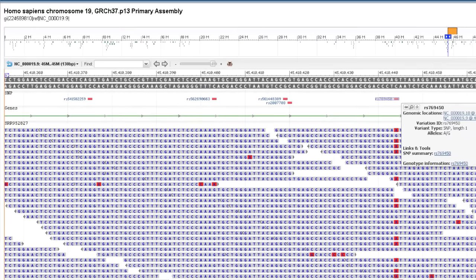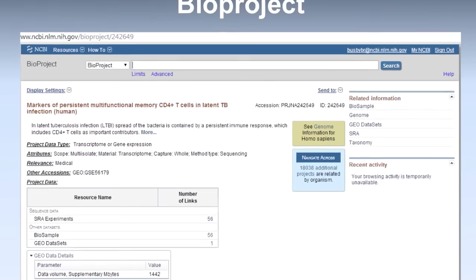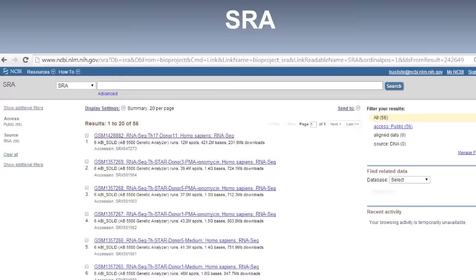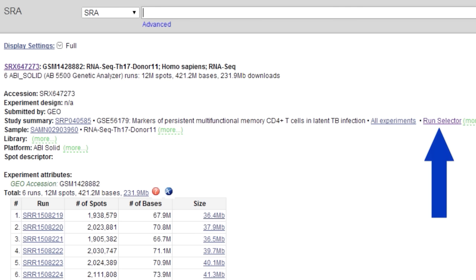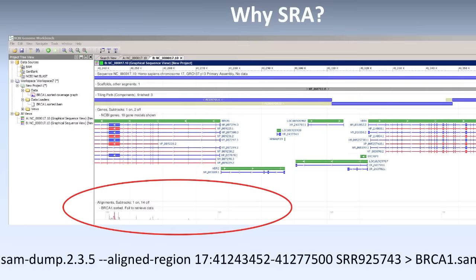This is the Homo sapiens ApoE gene, and I can clearly see a het in one of the introns. Going back to RNA-seq data in tuberculosis, if I look at RNA-seq data for multi-functional memory T cells, I can go to the SRA page from BioProject, as I showed you before, and click on a particular experiment. This experiment will show me the number of runs, and I can also click on the run selector and get a variety of metadata about the particular experiment. Currently, many studies in the run selector in SRA have quite a bit of metadata.